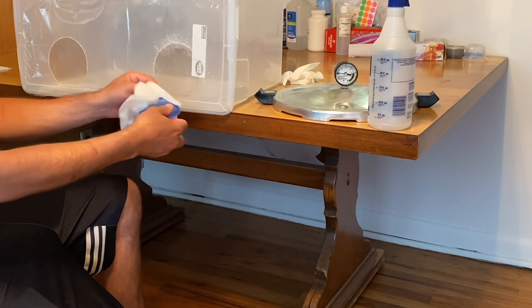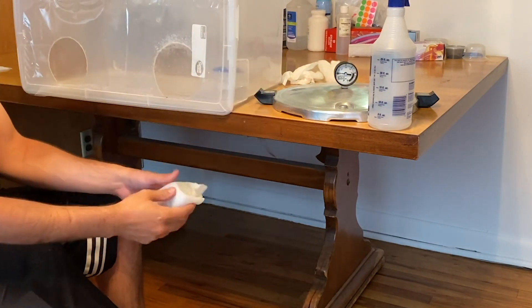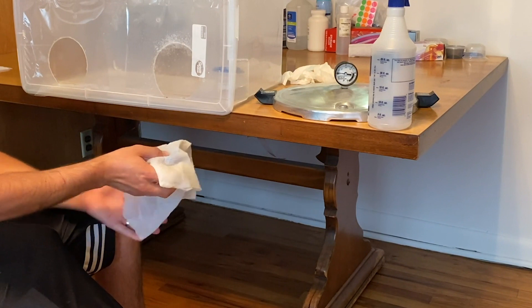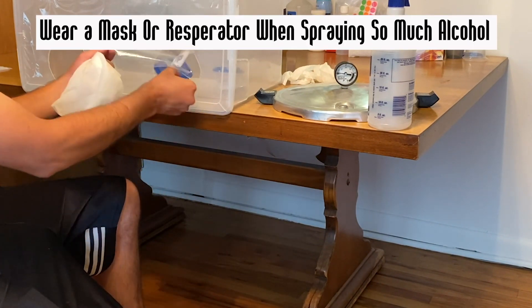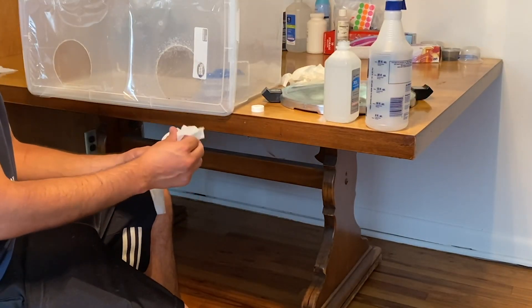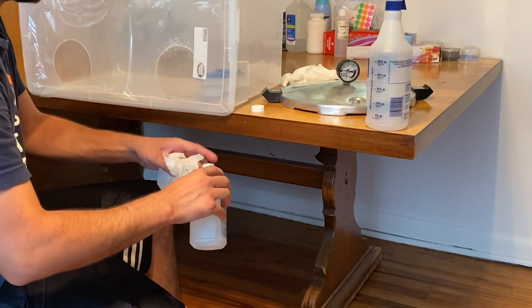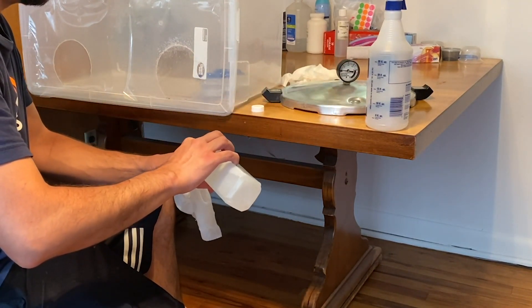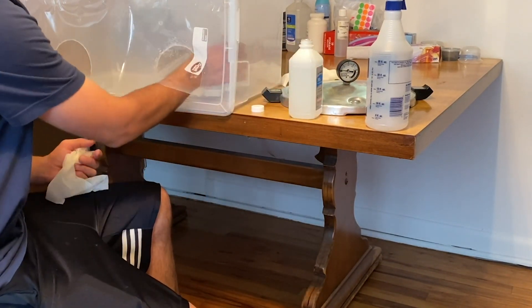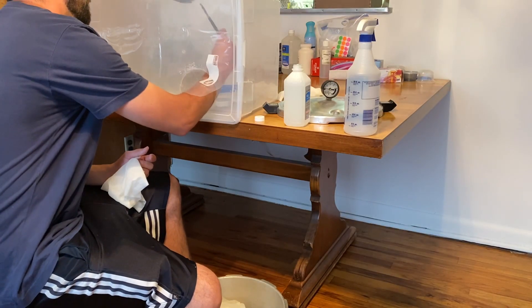Now I put my tools into the still air box, spray down my hands with rubbing alcohol again, and take out the tools that have paper towels around them. Quickly, but without making swift movements, I take the paper towel off and put the items into the box. As I said, aluminum foil is better than paper towels around these items but that's all I had. Anytime I take my hand out and put it back into the still air box I disinfect with rubbing alcohol. Pour some rubbing alcohol into the small sterilized jar and put the forceps into it.